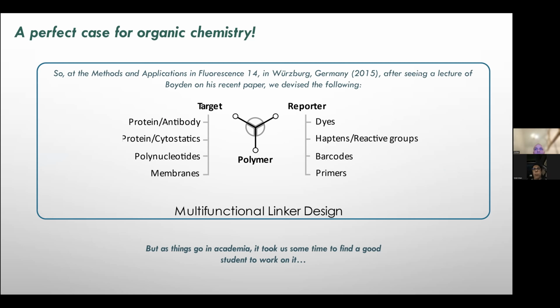And we said, Johan didn't say at the time, but we said, well, this could be something where our linker work is usable. And we then started thinking about combining functions into single linkers where you have the targeting moiety, a reporter moiety, and then this all can be grafted to the polymer.